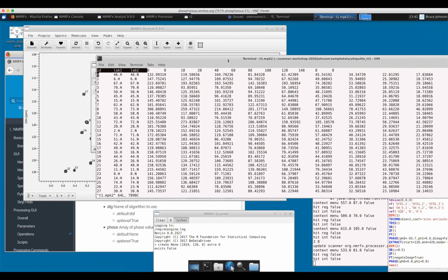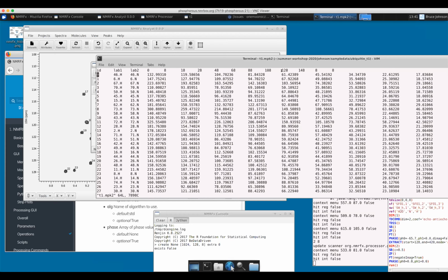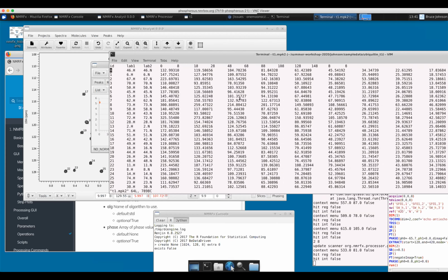And then across the top, this actual file I've already translated, I think. If I didn't do any changing and just used that counter, this would be the counter number. I think this file I've already translated into milliseconds. But the header would be counts or milliseconds, and then each row are the intensities, however we measured them for each peak. So you can see the intensities falling as we go across, and then there are some replicate values that jump up. So that file, you could analyze wherever you want.